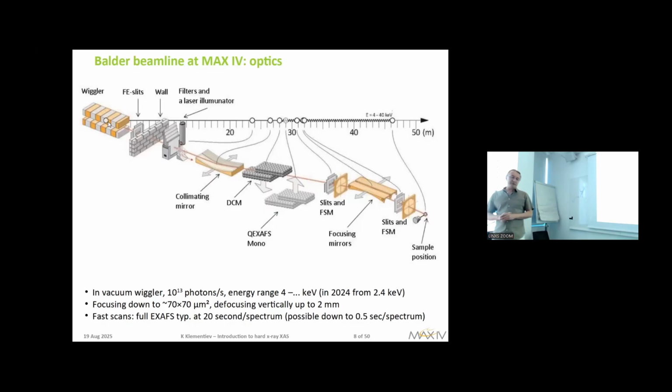The difference is that in the spectrum of the emitted light, a wiggler produces a very broadband spectrum. This is what we want because we want to scan very quickly at our beamline. Undulators produce a peak-like photon spectrum, which is also good. In the peak, the peak brilliance is higher.